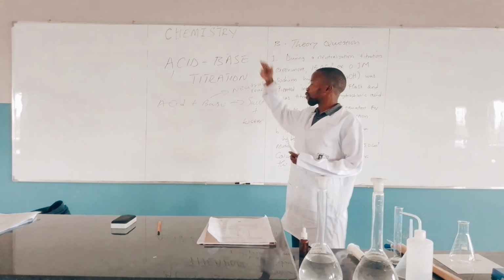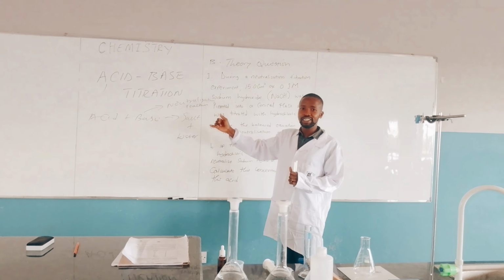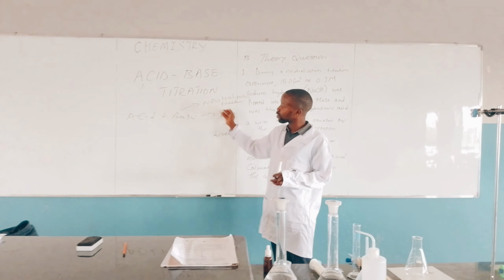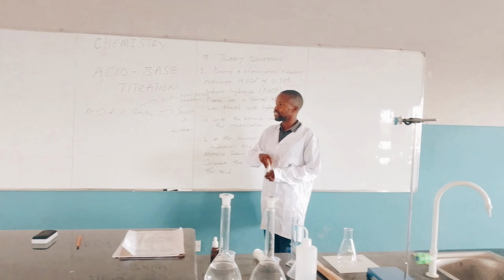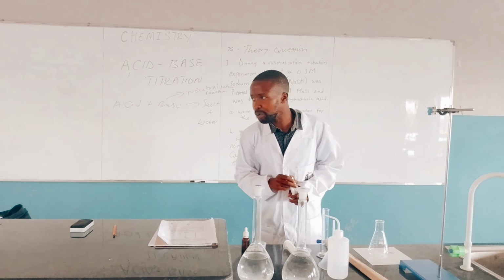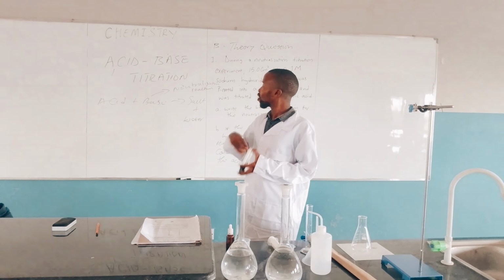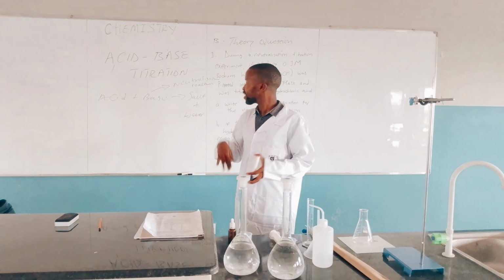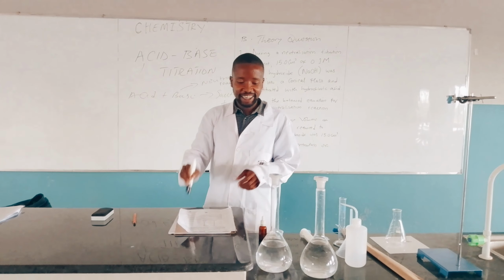But let's say that we're given an acid as well as a base, and we want to look at the end point of our reaction. We talked about the different indicators that we can use for acid-base titration, and the common one is an indicator. In our experiment today, we're going to use an indicator, an acid and a base, to demonstrate the acid-base titration itself.